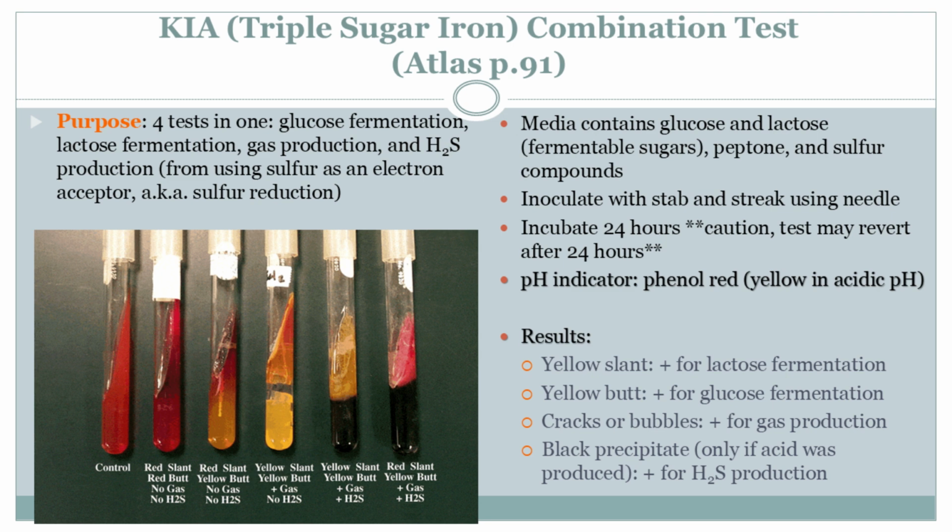And it's not just for medicine. You can use it for food safety, to make sure that our food is not contaminated with harmful bacteria. You can use it in environmental monitoring. If you're testing water samples or soil samples, you can use this test to see what kind of bacteria are present. So this test is done behind the scenes all the time, to make sure that everything's okay. Pretty much, it's a workhorse.